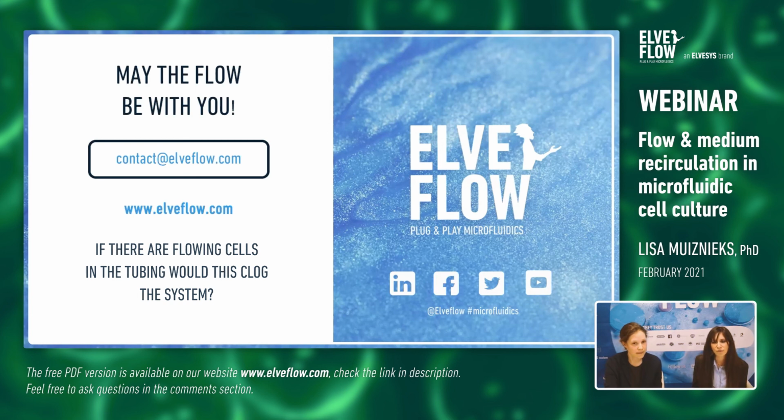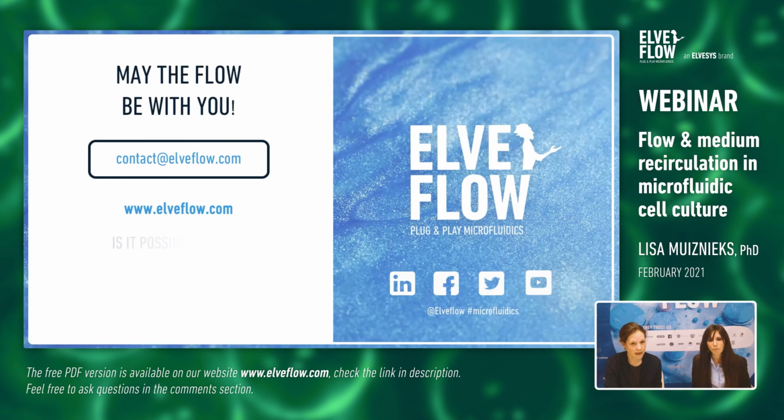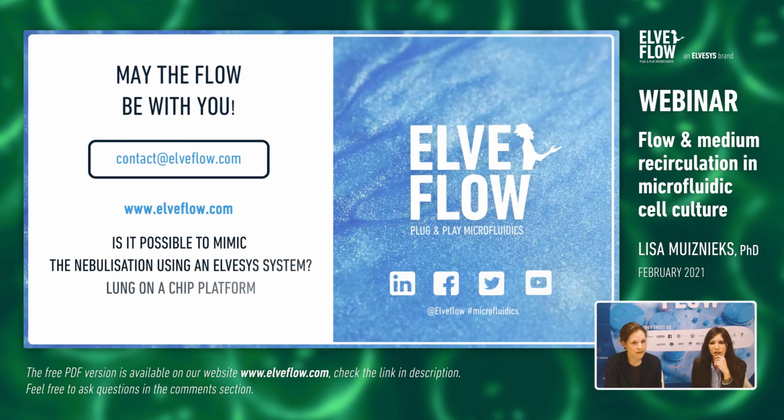Is it possible to mimic nebulization using the Elveflow system on a lung-on-chip platform? Yeah, so I think you're referring to adding vacuum to one of the channels to stretch a membrane. Yes, for sure. Or probably create a sort of air-liquid interface. Is it what you mean? Maybe like flowing air of a specific concentration or a specific mixing.